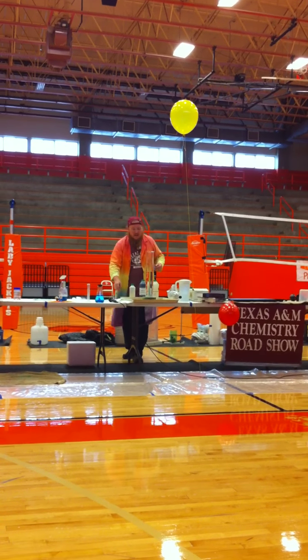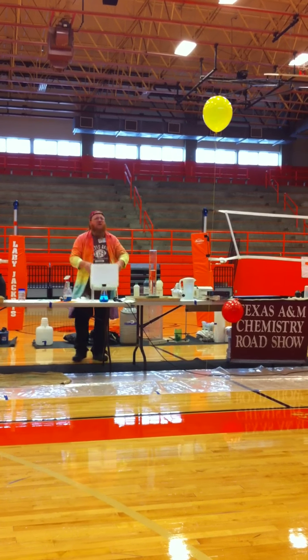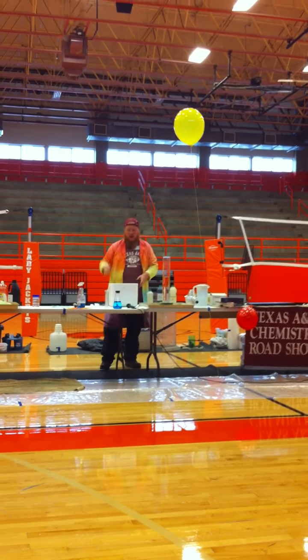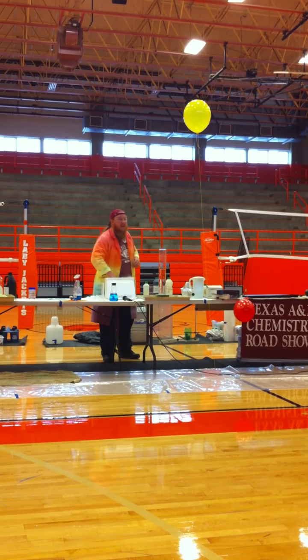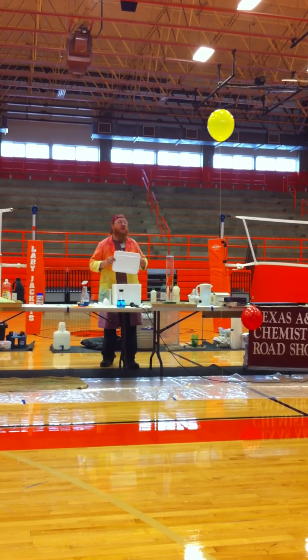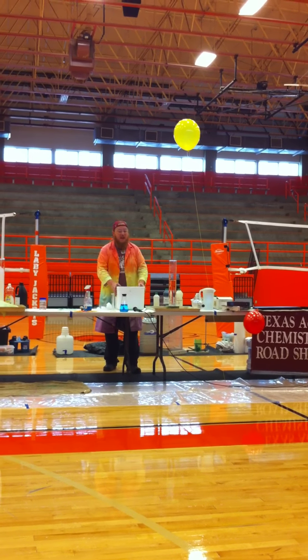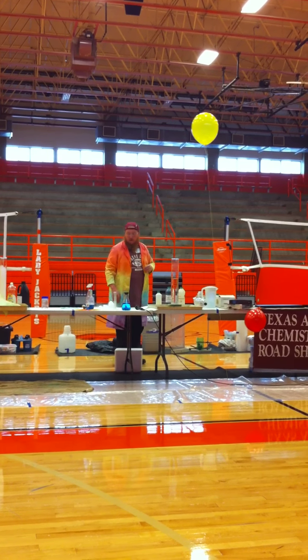All right, now this next demonstration is going to use the dry ice again. Our first demonstration with the dry ice, the bubble, was that a chemical change or a physical change? Chemical. No, that was a physical change. We went from solid dry ice to solid carbon dioxide to gaseous carbon dioxide, but it was still carbon dioxide. This next one is going to be a chemical change.